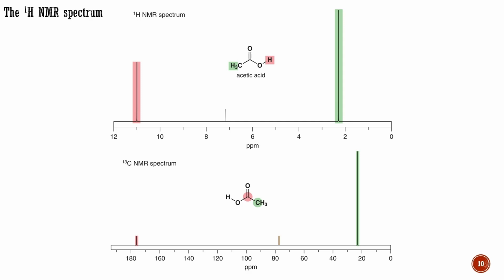The carbon NMR spectrum is shown below. Proton NMR spectra have many similarities with carbon NMR spectra. The scale runs from right to left, and the 0 point is given by the same reference compound, though it is the proton resonance of tetramethylsilane rather than the carbon resonance that defines the 0 point. However, as you immediately see in the spectrum above, the scale is much smaller, ranging over only about 10 ppm instead of the 200 ppm needed for carbon.